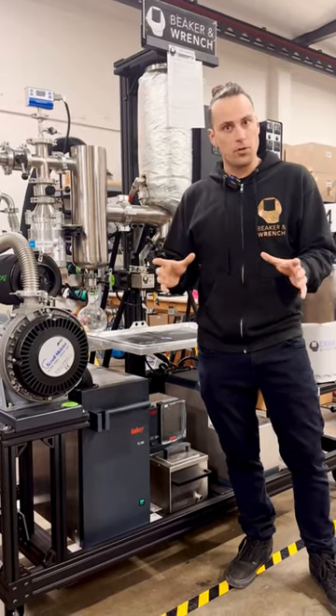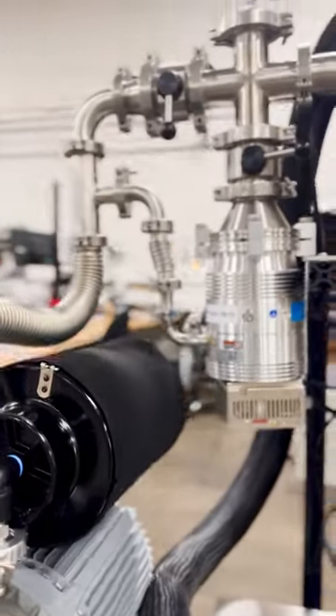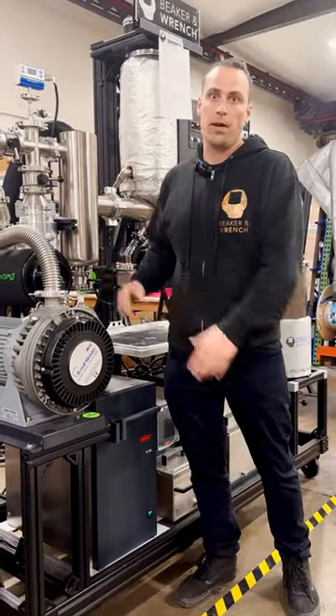The additional benefits are that the turbo pump over the diffusion pump offers a much faster startup time and significantly reduced maintenance for both pumps.